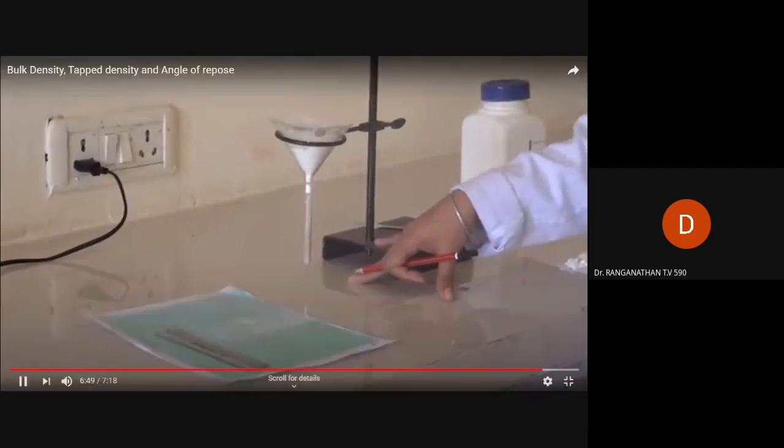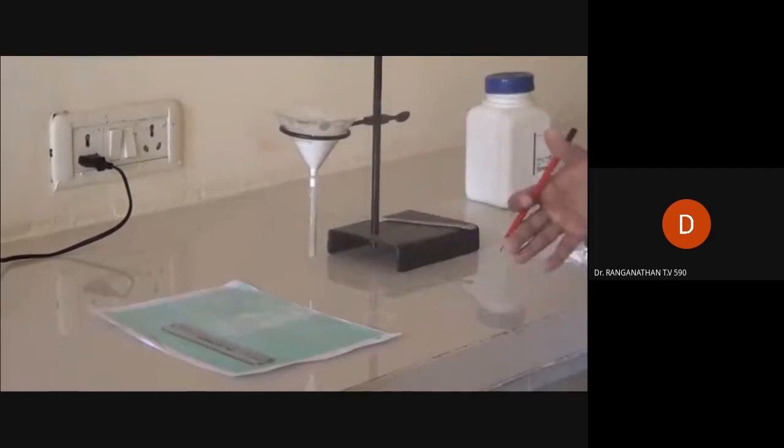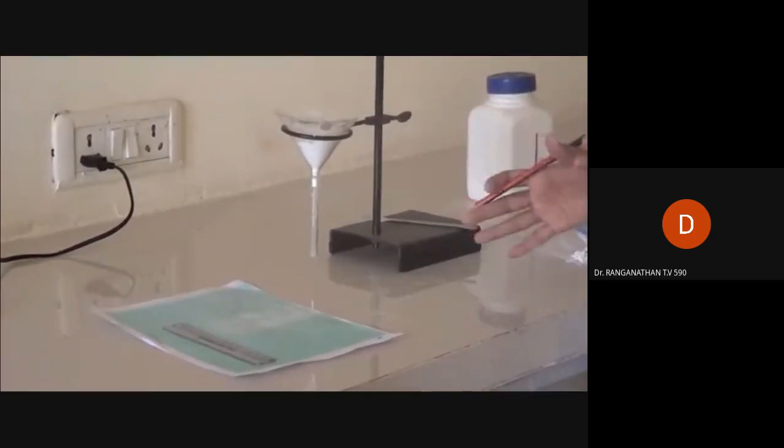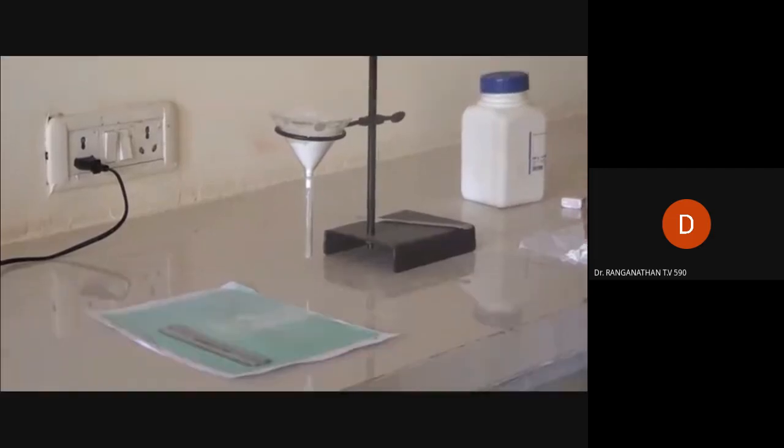So we will place these values into the formula and calculate theta, that is the angle of repose, and we will compare the theta value with the reference flow property and angle of repose table, and we will determine the flow property of the powder. So from these two methods we can determine bulk density, tapped density and angle of repose of a given sample of powder. Okay, now coming back to our presentation.